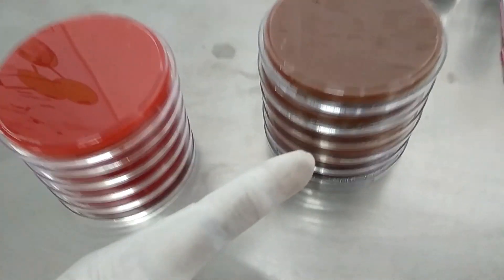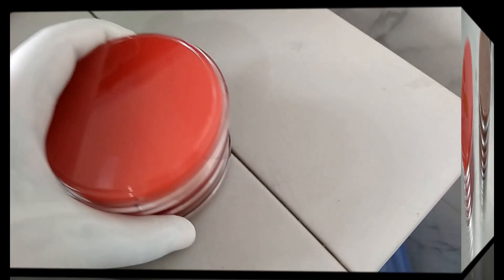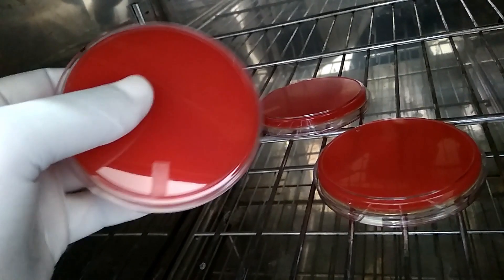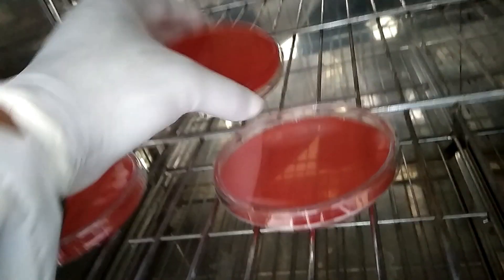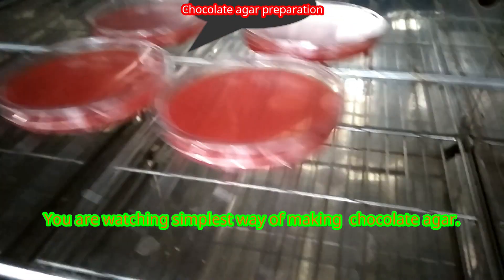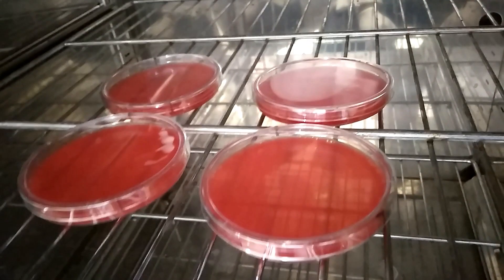Now take some plates and put them into the incubator as shown here. Always remember how to put the petri plates. Here we have blood agar that we have to change into chocolate agar in a very simple way.